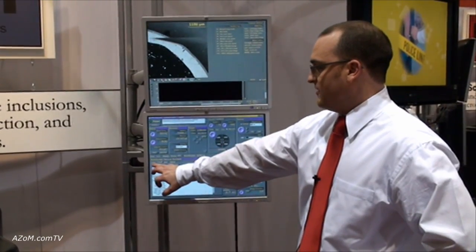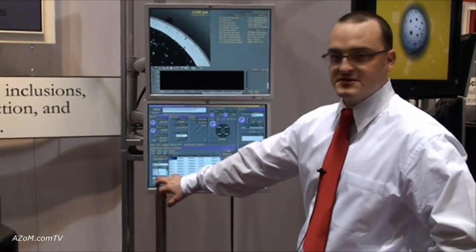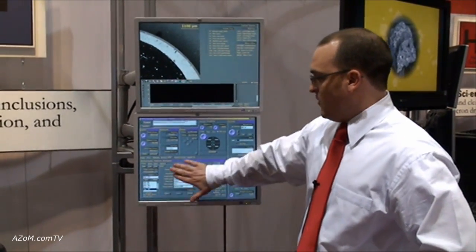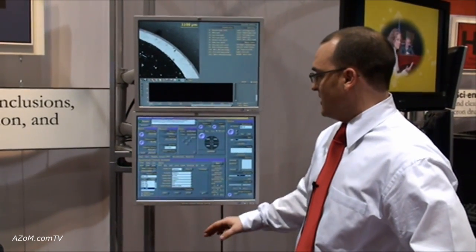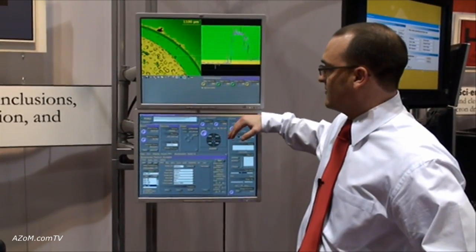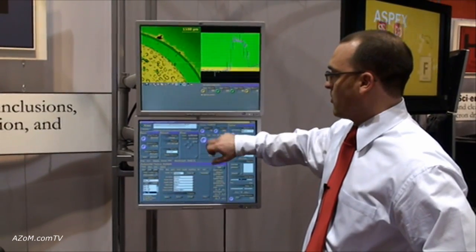On the setup tab we have the ability to input multiple runs — here we have a list of 102 runs. Clicking the analysis section lets you input information about the sample. Once the sample is set up, you check your video level thresholding: anything in green will be detected and anything in white will be analyzed as a particle.